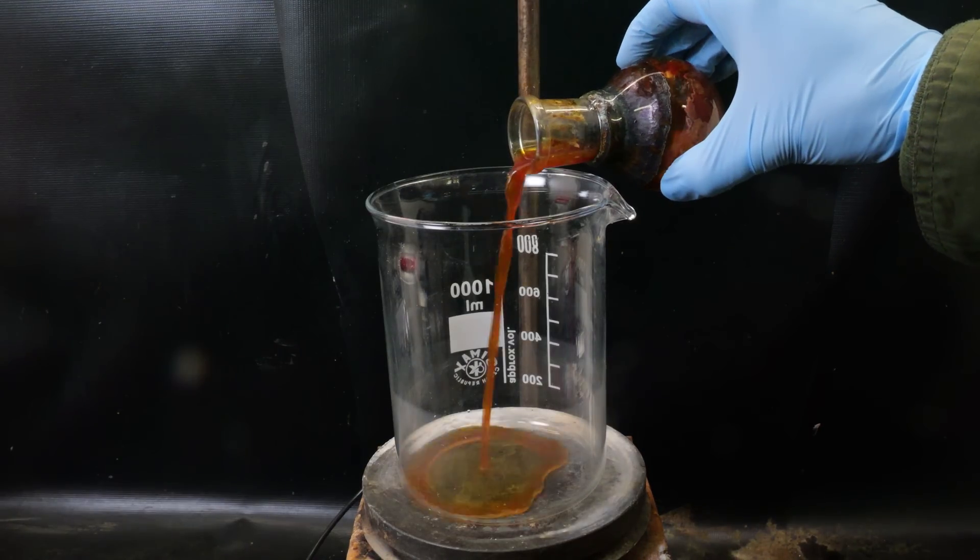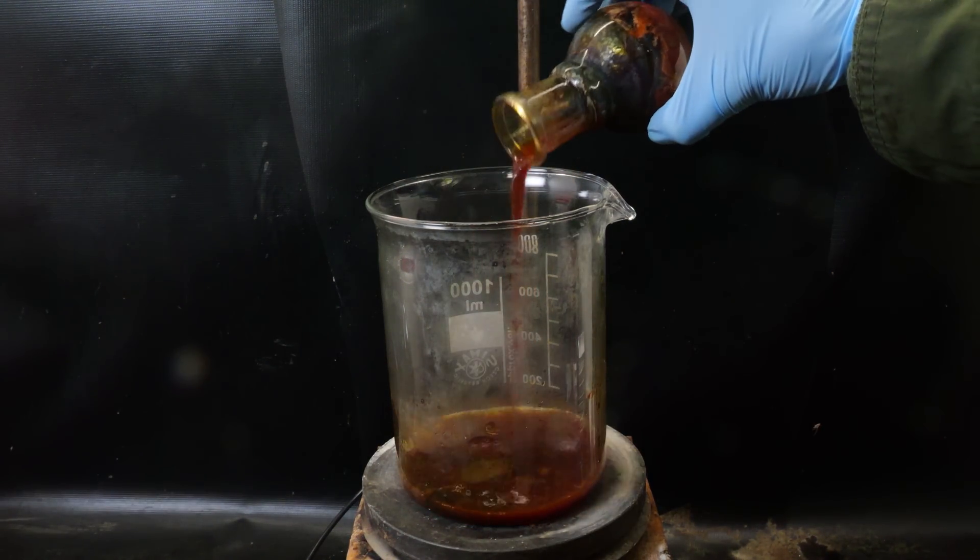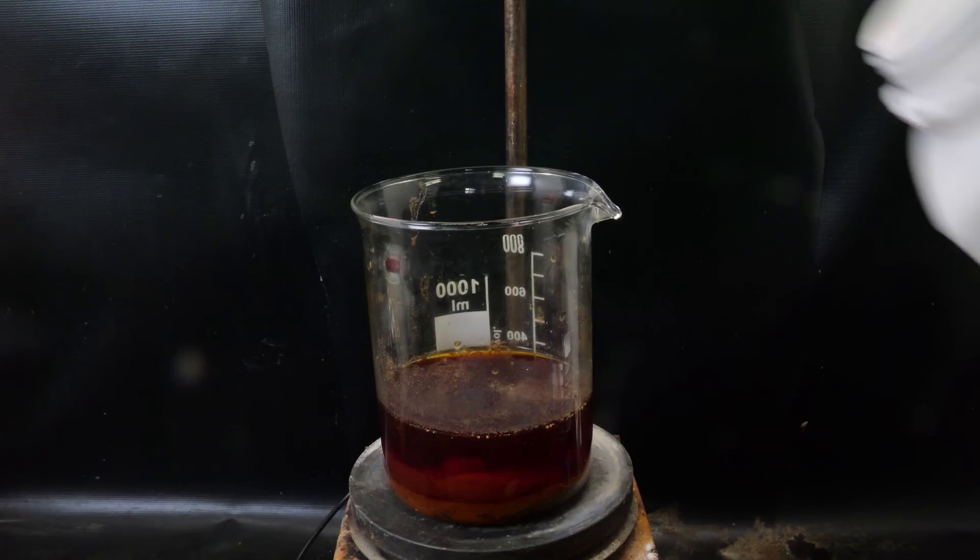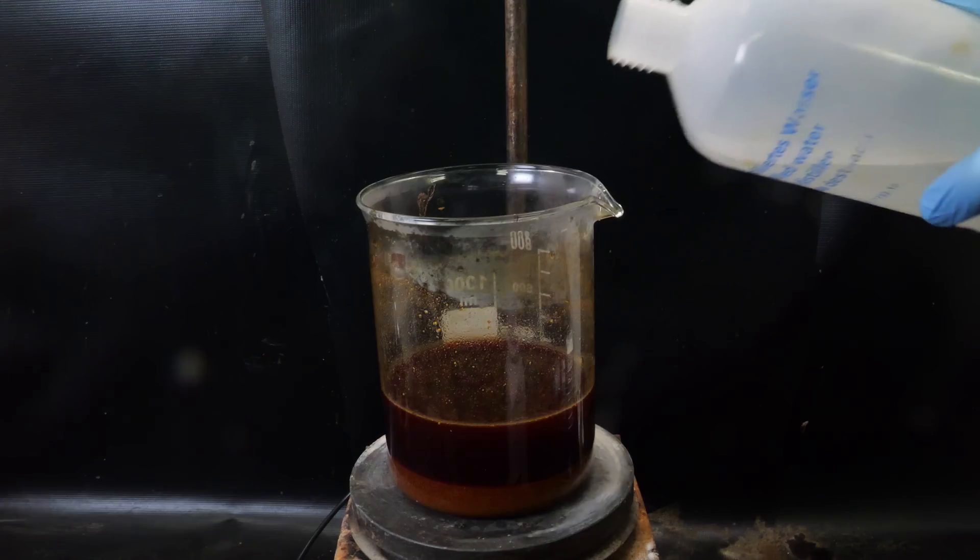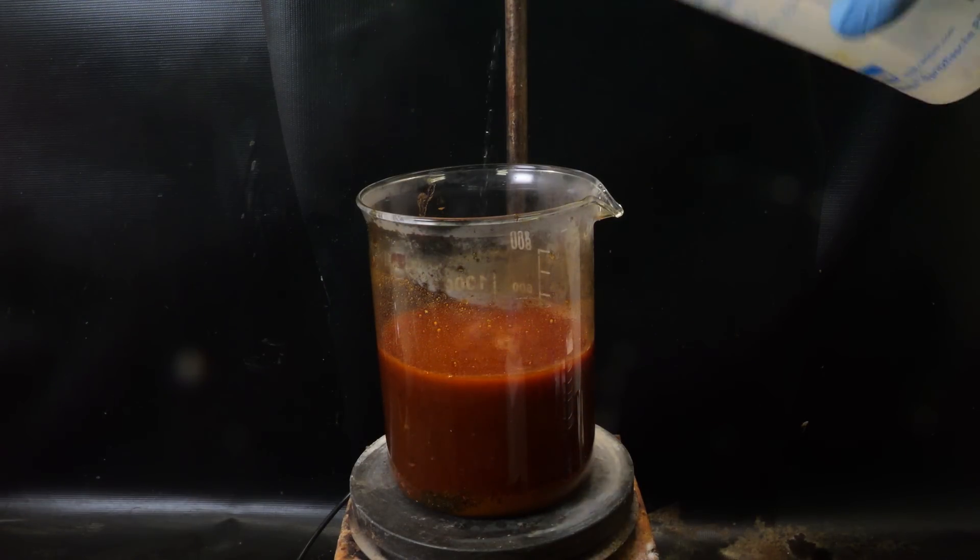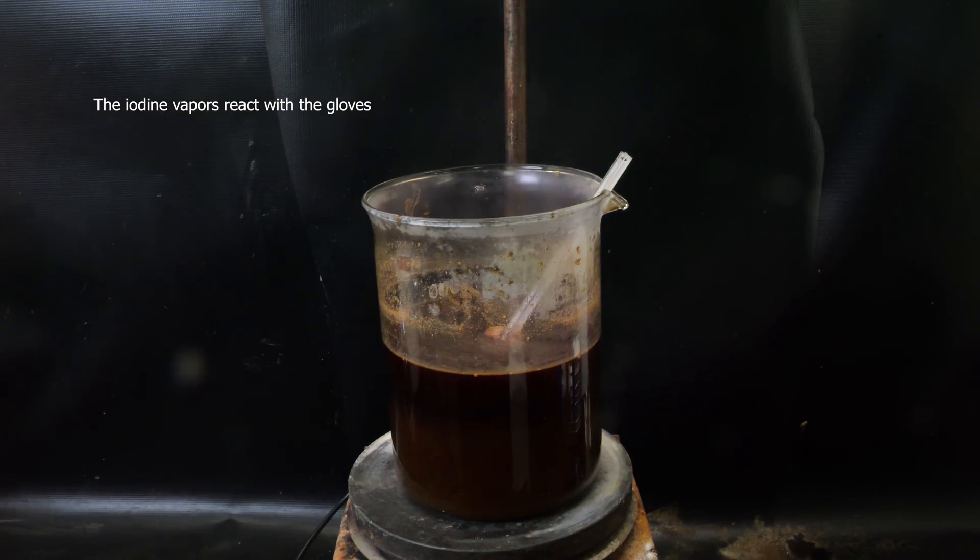I transfer all of the contents with more water to a big beaker. Now to destroy remaining acid and excess iodine, I add sodium hydroxide until all the iodine disappears. I also diluted it with some more water. It produces a lot of heat and a lot of iodine vapors come off.